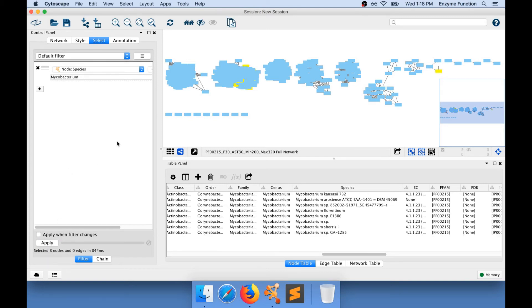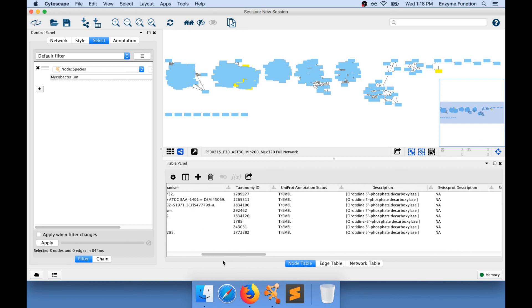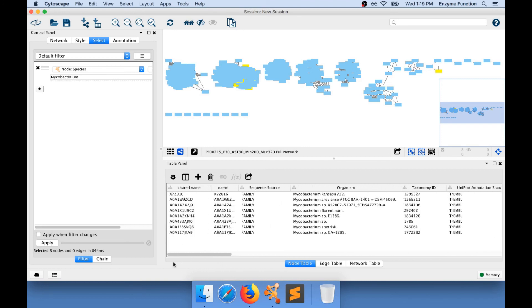In my network, I know of eight nodes that have been selected that are from species that contain the word Mycobacterium. You can see in here all the IDs of the protein from the particular protein family I am working with that are present in several of the Mycobacterium.